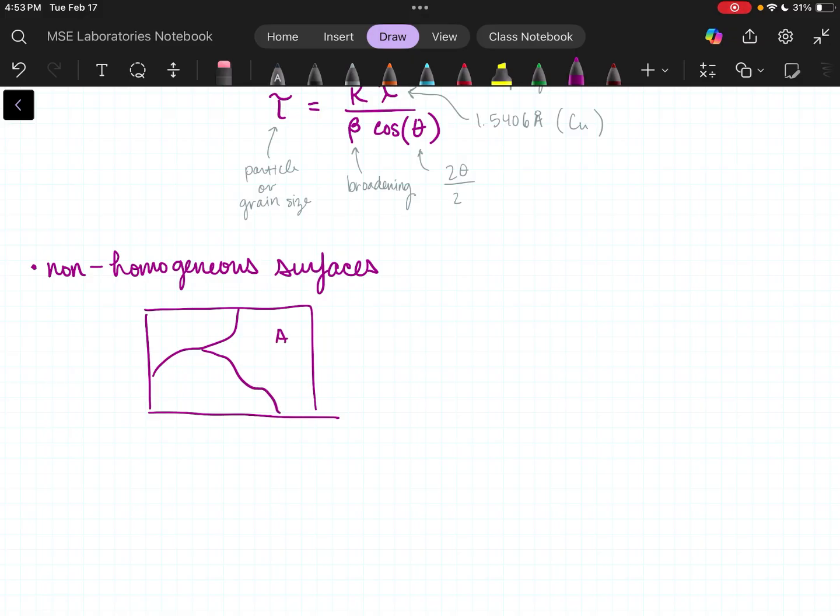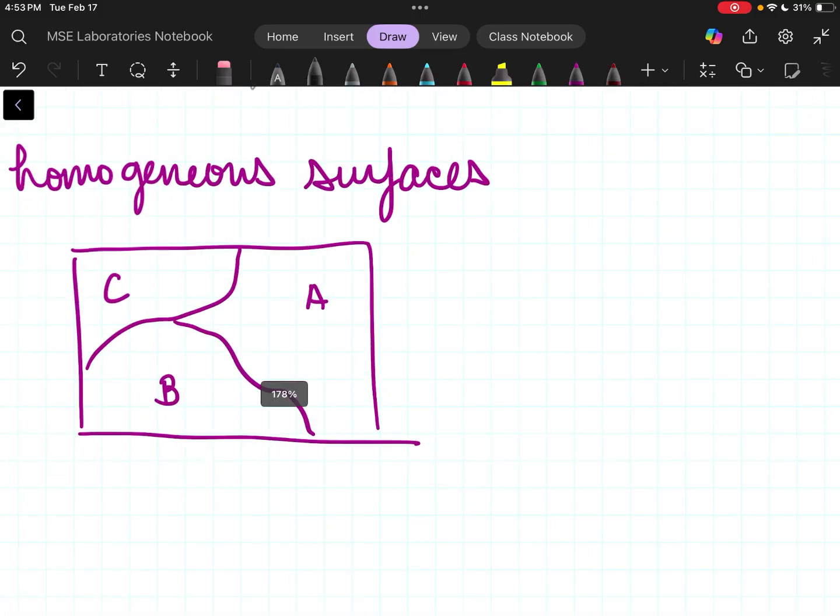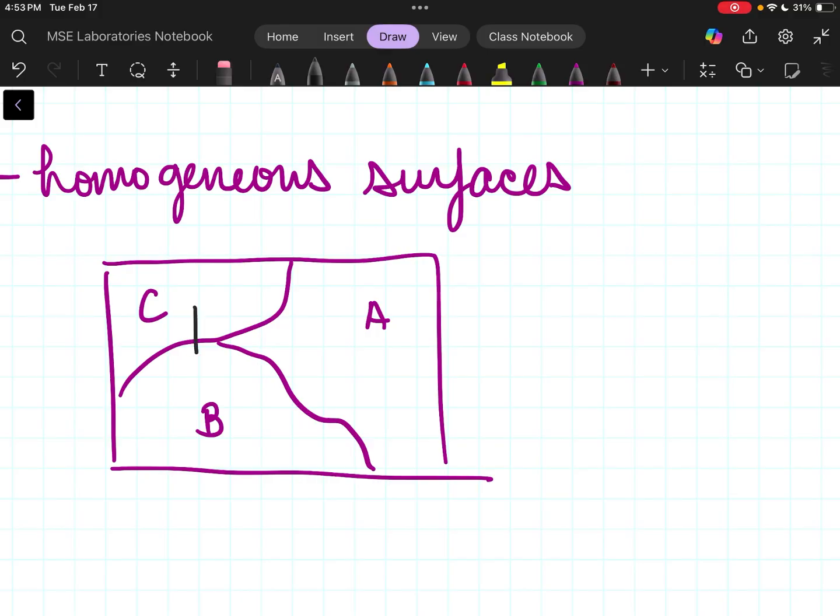Let's say I've got a rock, and I'm going to draw a picture of my rock rather than the rock itself. But the rock has these sections where it's like greens and reds and whites. And I throw this in a microscope and I can see where these 3 sections are separate from one another.